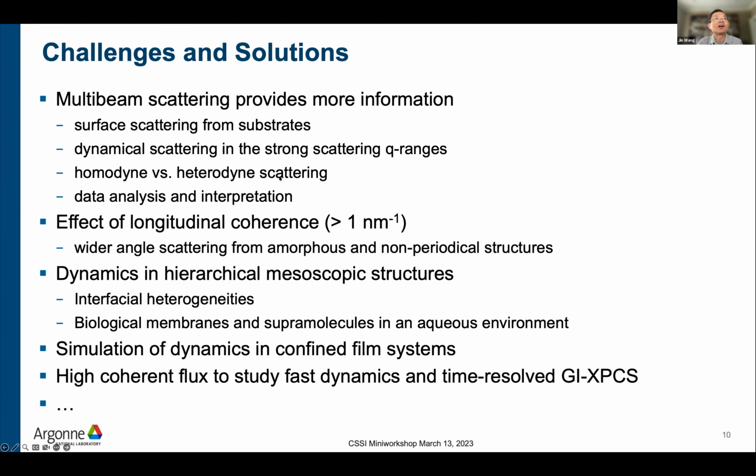So with these state-of-the-art capabilities, there are also challenges, and we're looking at this to find solutions. The GISAXS reflection geometry gives us a lot of opportunities to look at heterogeneous structures and anisotropic dynamics in the films, but it also brought some complications, such as dynamic scatterings in the strong scattering Q ranges.